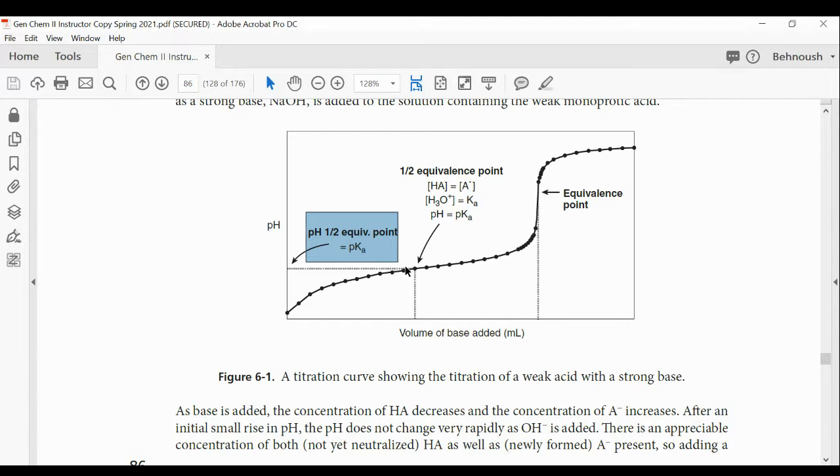And that is the purpose. It is also asking you to find the concentration of the acid. In order to find the concentration of the acid, you need the concentration of the sodium hydroxide that you are using. So if your concentration for sodium hydroxide is known already, or you do the standardization first and find the concentration, then you can use the molarity of sodium hydroxide to find the concentration of the weak acid also.